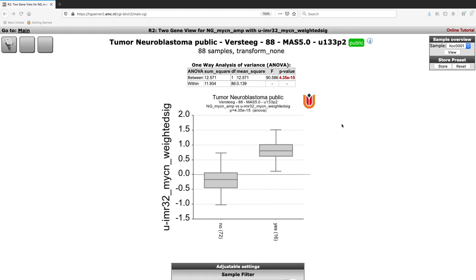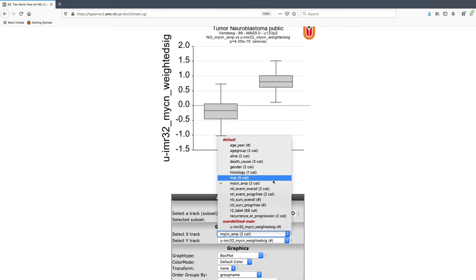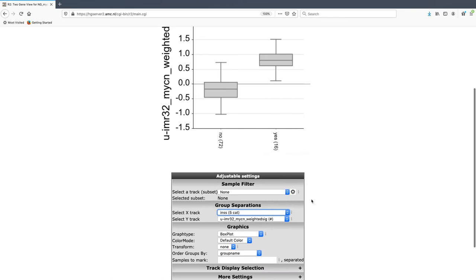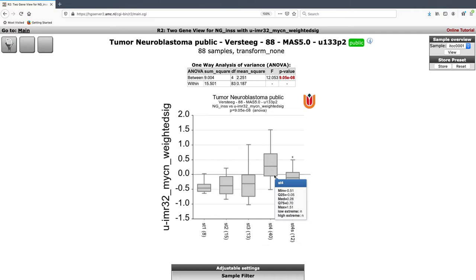We can also correlate the signature score with other tracks in the dataset. For instance, comparing to INSS classification of neuroblastoma disease stages, we can see that specifically in the stage four subset — the more aggressive tumors — there is a significantly higher MYCN activity or higher expression of the signature score. This confirms that the signature score correlates meaningfully with known clinical characteristics.